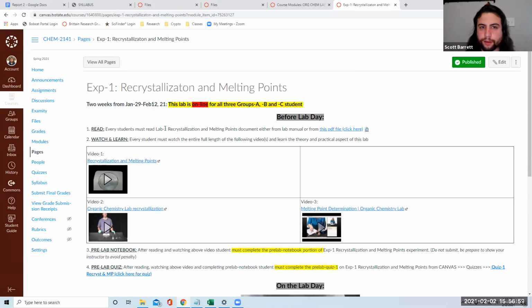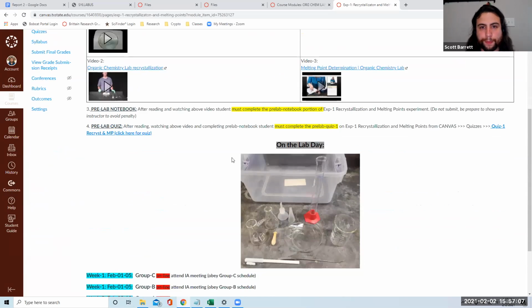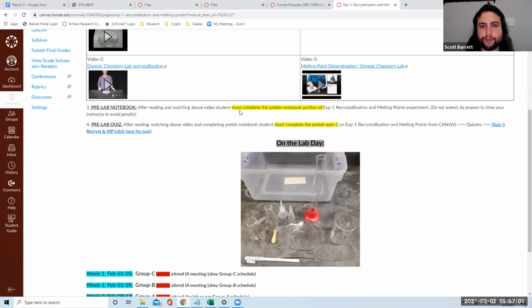So make sure, first, that you read the manual, and we're going to go ahead and go through that here in a moment. Then secondly, watch and learn all of these videos here. Thirdly, complete your pre-lab notebook, which is what you should have done currently. And then fourthly, complete your pre-lab quiz.